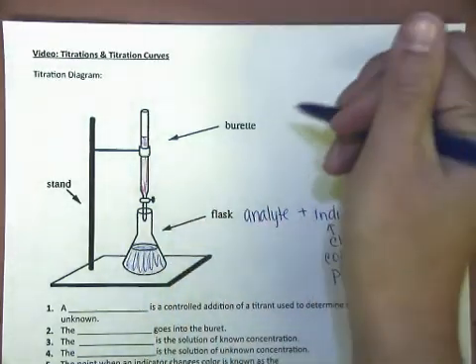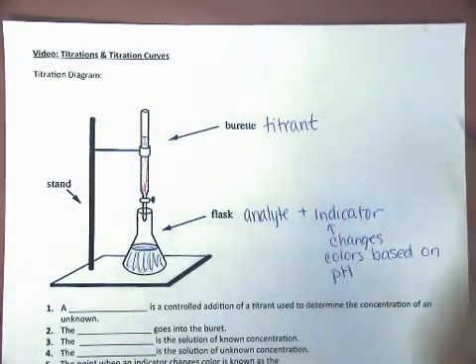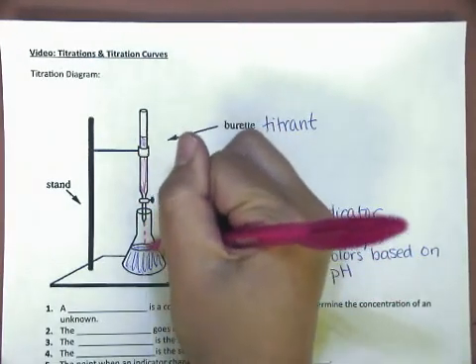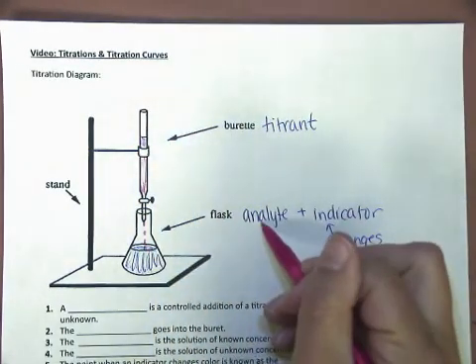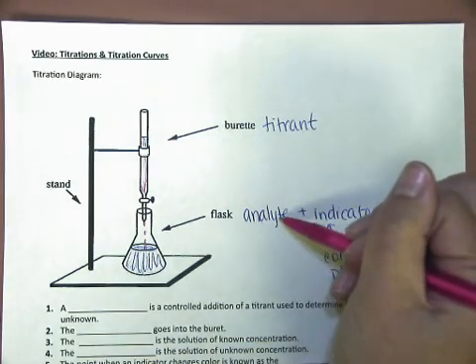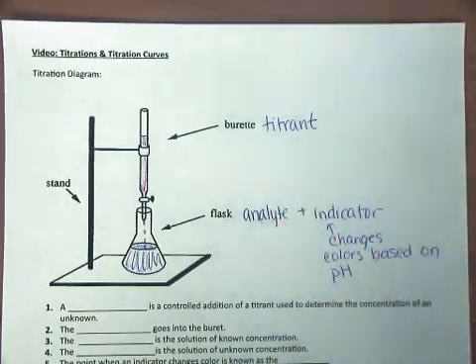Our burette contains the titrant. Our titrant we release down into our analyte, and we record the volume of titrant used, the volume of analyte we started with, and that with some math can tell us the concentration of our analyte.